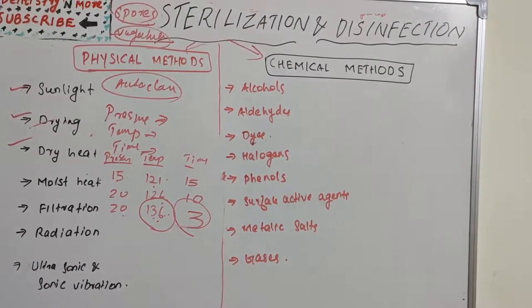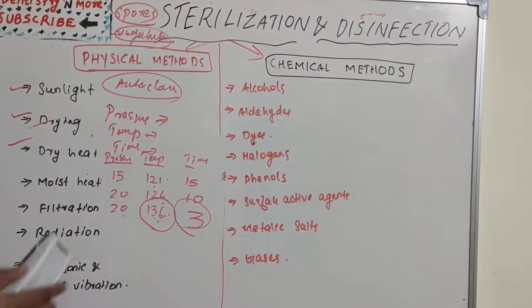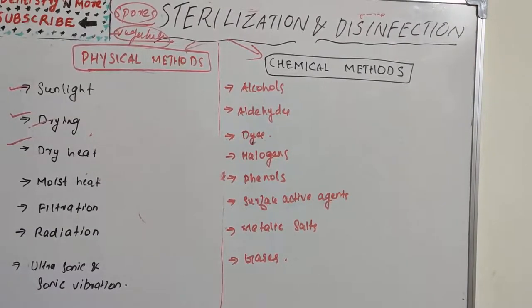So what are the considerations we need to think about when autoclaving? There are lots of things to keep in mind. We should ensure complete air removal for the temperature to reach 121 degrees Celsius, and ensure loose packing of the chamber, because tightly sealed materials may become dangerously pressurized, causing injury when removed. It can be used for disposable syringes, glassware and metal instruments. It is very commonly used in all hospitals, dental clinics, and every healthcare facility will have one or two autoclaves, and it can also be used for surgical instruments, laboratory equipment, culture media and pharmaceutical products.